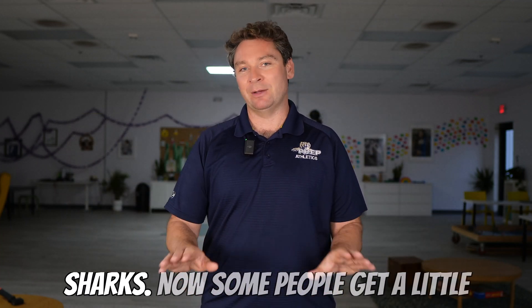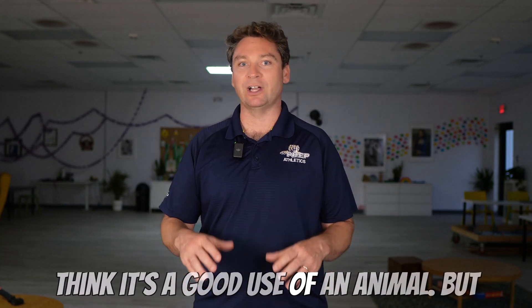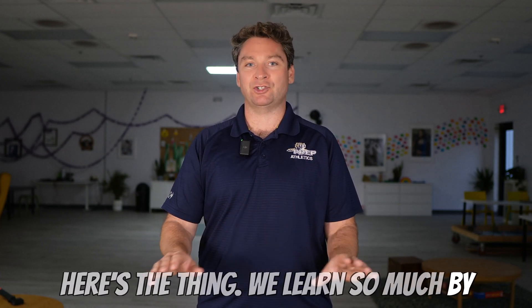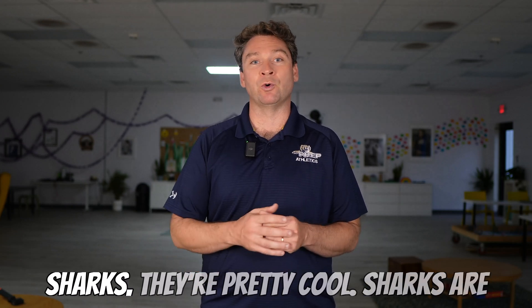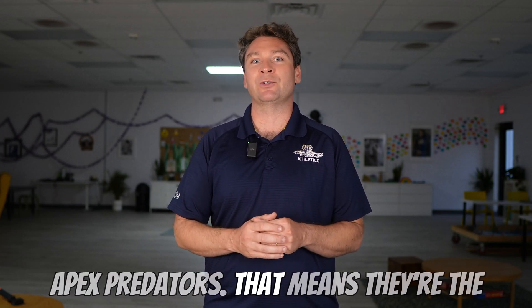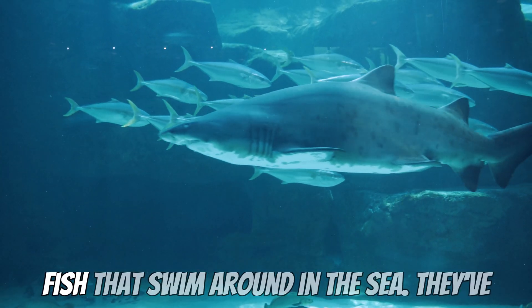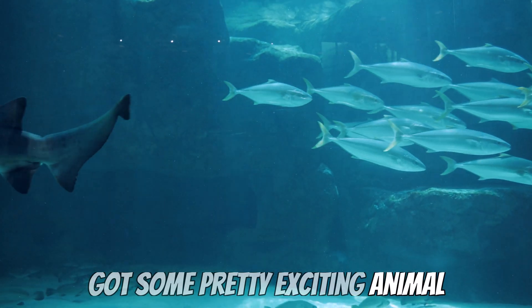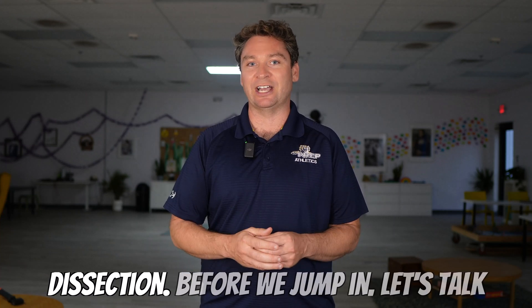Some people get a little squeamish around dissections or don't think it's a good use of an animal, but here's the thing — we learn so much by doing these scientific investigations. Sharks are pretty cool. Sharks are apex predators, which means they're the top of the food chain. They've got some pretty exciting animal adaptations that we're going to be exploring as we do this shark dissection.